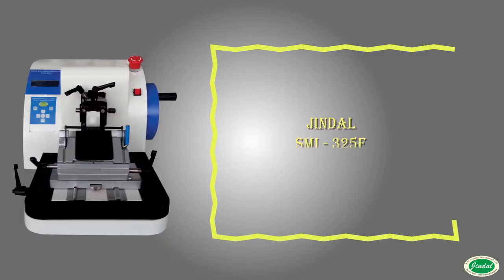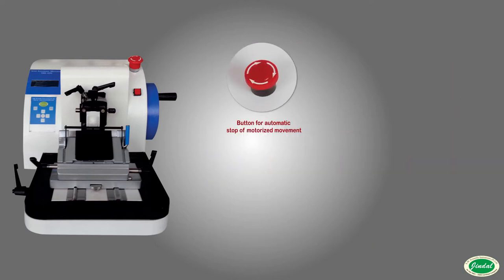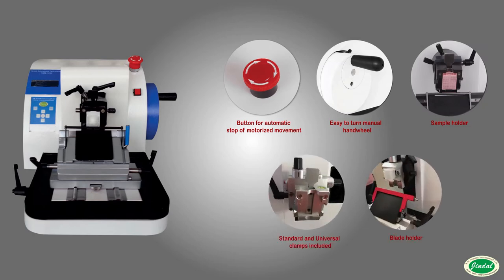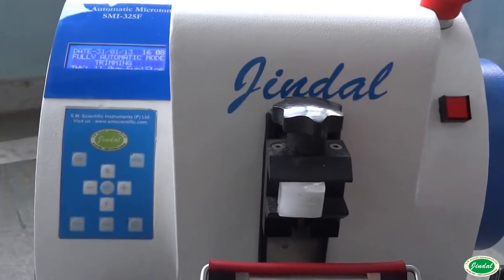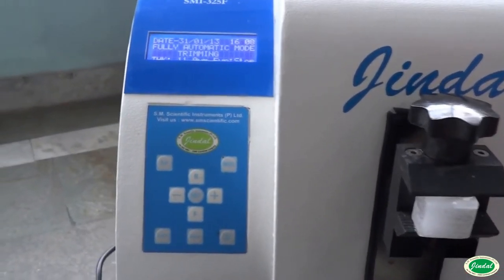The fully automatic microtome satisfies all of your laboratory's requirements. The fully automatic motorized microtome is designed to provide superior sections of a multitude of specimen types with ease. All functions are controlled via soft touch buttons located on the sides of the block holder.